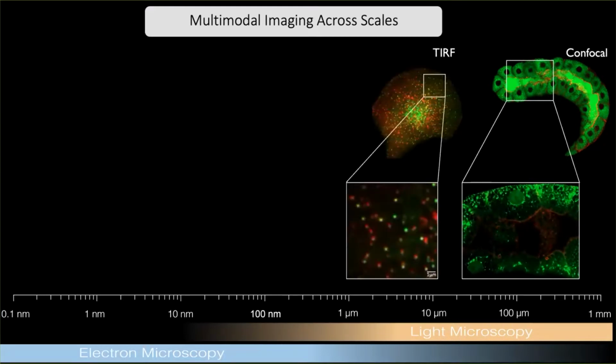Now, it's possible to overcome some of the challenges here if we reduce the dimensionality. For example, if we were to use total internal reflection fluorescence microscopy, if you are unfamiliar, just keeping to basic terms, this is an imaging modality in which we only illuminate about 100 nanometers at the basal surface of the cell. The principle is that the laser beam is totally internally reflected once it hits the interface between the glass, the substrate on which we grow the cells, and the liquid.